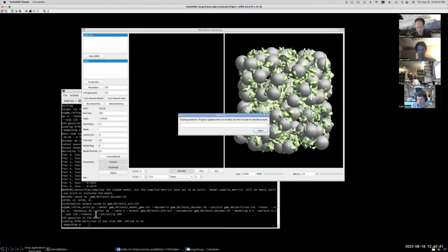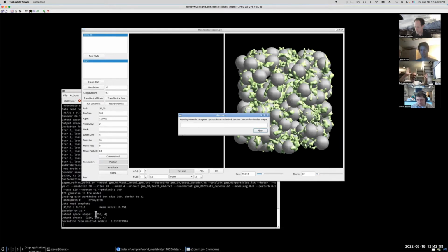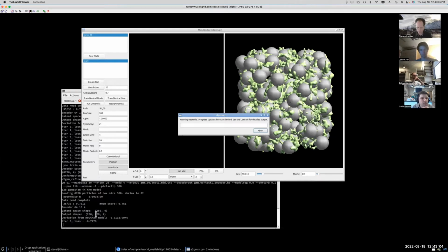Well, I was going to just say, this would maybe be more useful for me, and this is what I've already started doing just for developmental purposes. But would it be possible, do you think it'd be worth people's time, to just quickly go through the Python code and say which chunks are doing each section? We'll talk about some other stuff while this is running. I just want to know whether it's likely to finish during today, and it looks like it will. Yeah, it looks like it's running pretty fast. Okay. Yeah, we could take a quick look at the Python code.